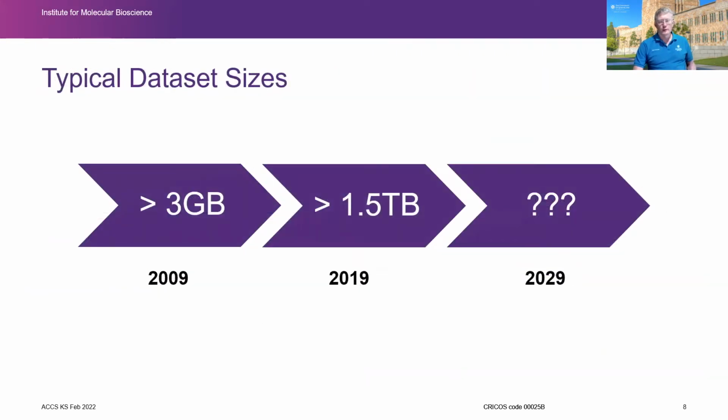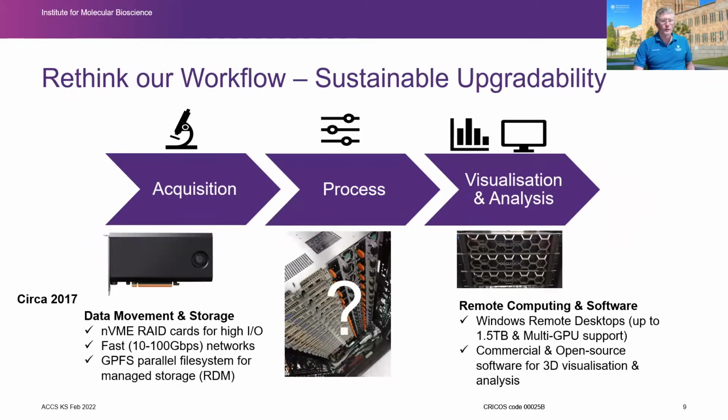So within a short space of around 10 years, our total facility data generation has increased by a factor of 50. Many of our systems routinely produce 1.5 terabyte data sets, and they require subsequent processing, often with multiple steps. Each step often doubles the data size, and since new camera technology is constantly being developed, we know that the problem wasn't going to go away, and that this is also a nationwide problem. So it was time to rethink both our hardware and workflow strategy to make it scalable for the future.